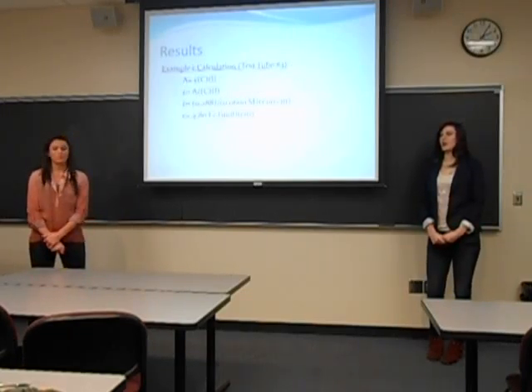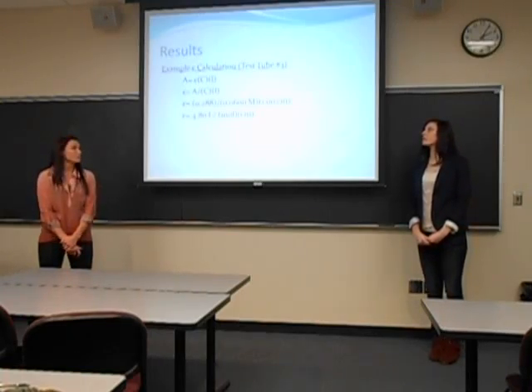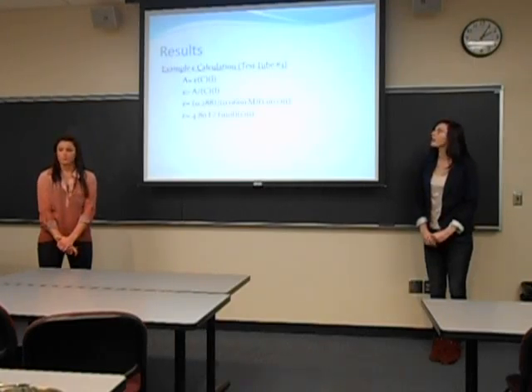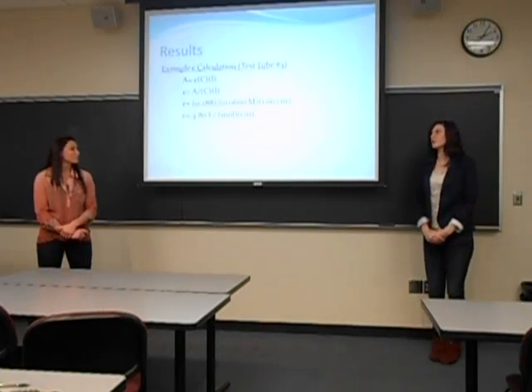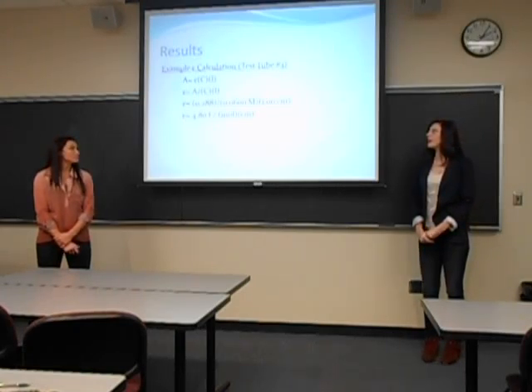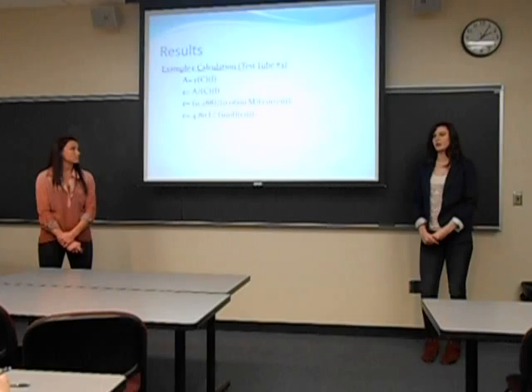This is a sample epsilon calculation for test tube number 3 again. We use Beer's law, which is absorbance equals epsilon times concentration times the path length, which was a constant of 1.00 centimeters. Our absorbance at test tube number 3 was 0.288, and using all of our calculations, we found that epsilon equals 4.80 liters over moles times centimeters.